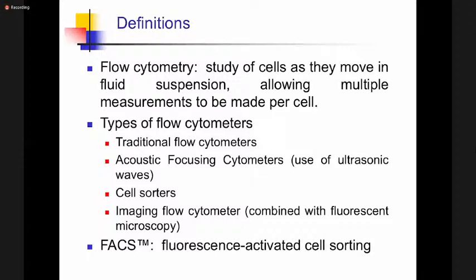So basically, even if you have a cell culture, or you can also do a touch prep, at your level right now, you are advanced in pathology. You want to analyze these cells, whether they are tumor cells or not, from a biopsy.